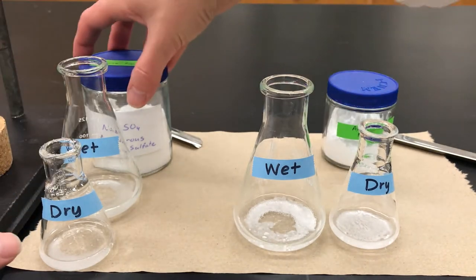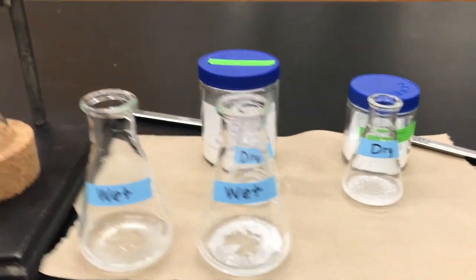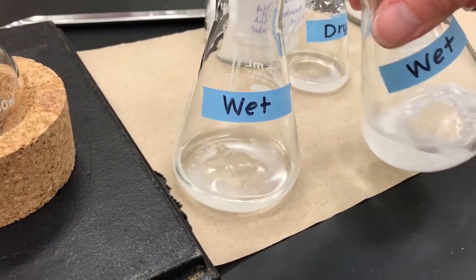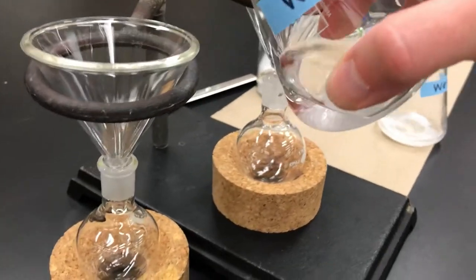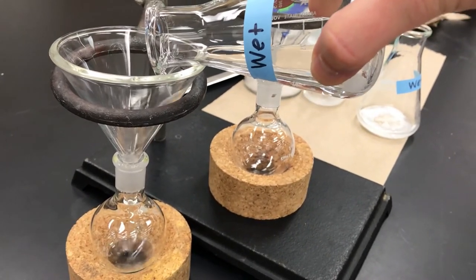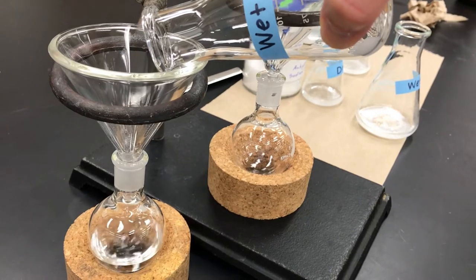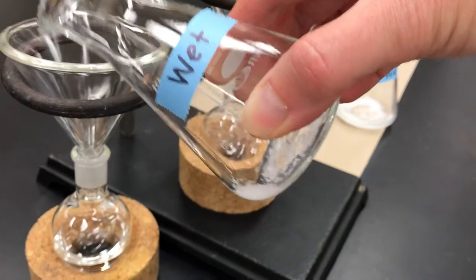Next you want to remove the drying agent. With sodium sulfate, the large particle size makes it easy to simply pour off the liquid. This is called decanting — you delicately tilt the flask and pour off the liquid with the goal of having the solid remain behind in the flask, leaving the solid residue of the drying agent behind.